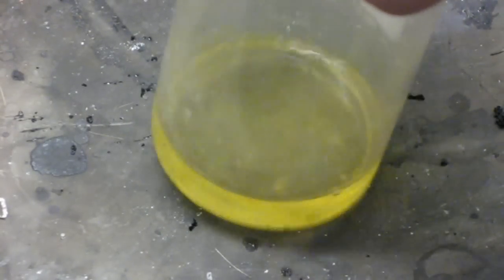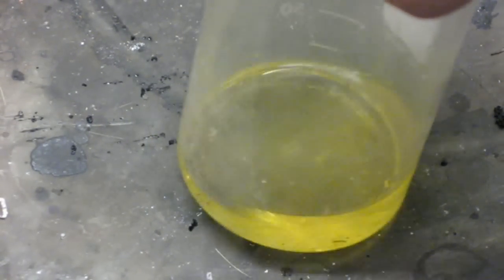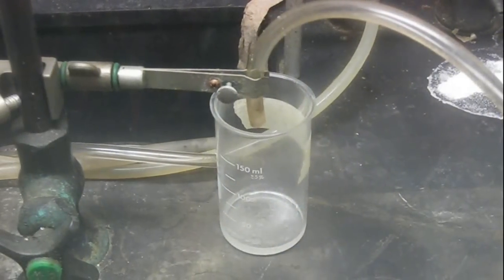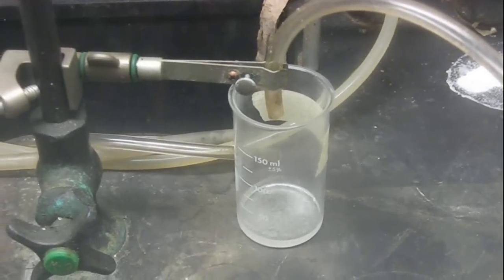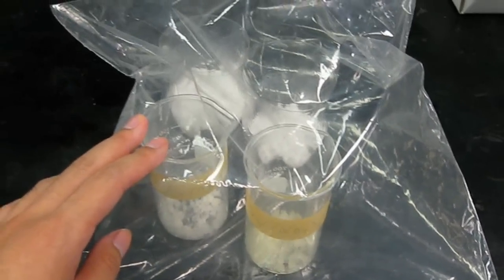Now another point. You might run into a situation where the solution doesn't crystallize even after a couple of weeks. Similar to hot ice you need to initiate it. The best way I found was to simply connect an air hose or a strong fan and blow air into the mixture, accelerating drying and initiating crystallization. Once it's initiated, put it into the desiccator bag for complete drying.